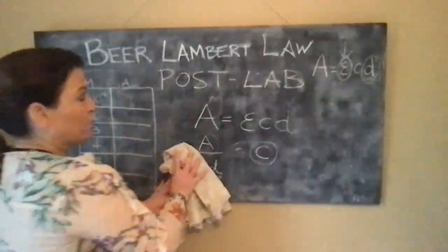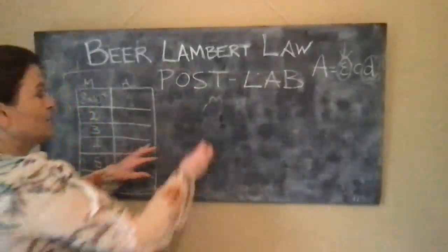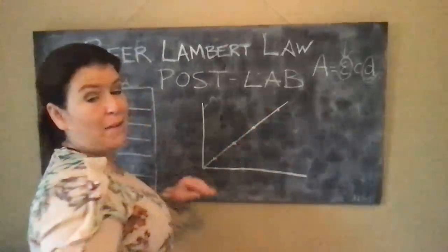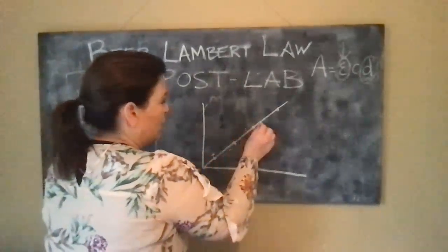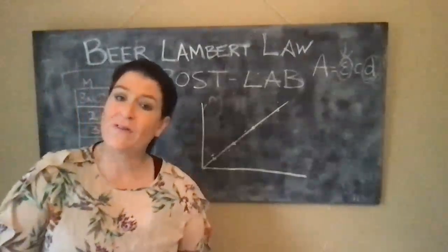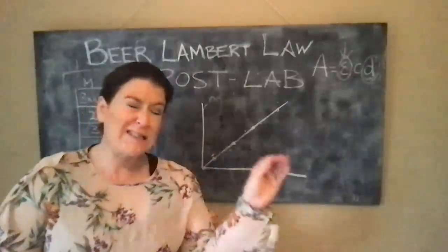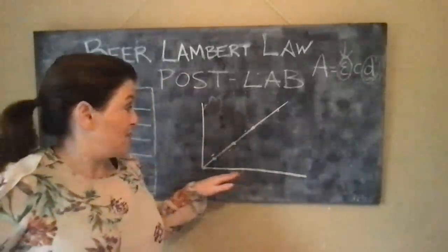Now, one of the things you should be looking out for in the conclusions could be, where did I put my chalk? So if, for example, when you create your graph, all your points are sitting beautifully on the graph, happy days. The reality is that's not going to happen. What you'll find is that there'll be some sort of deviation from the graph. That's a human error sign. That's a sign that when diluting down, you didn't dilute properly, there were slight changes. These are going to be very small and very low concentrations of solutions, so any slight deviation, even any slight hiccup in how you make up your solution, will make a difference to how accurate that is.